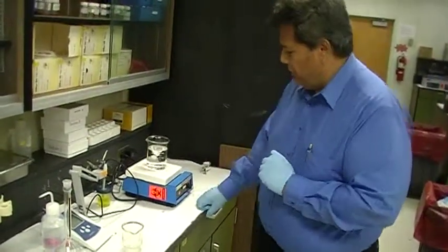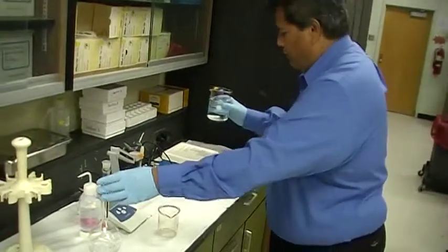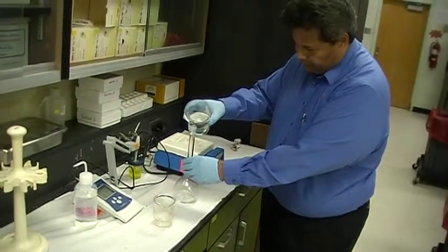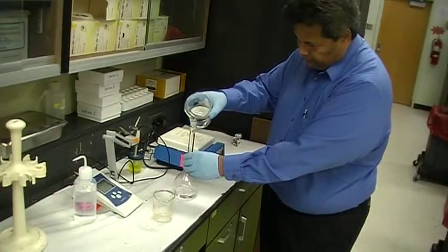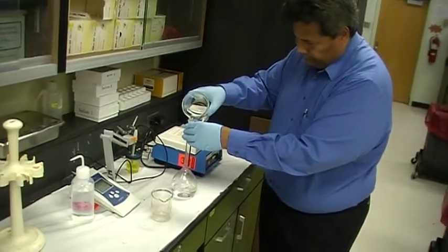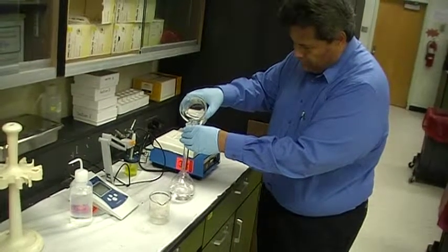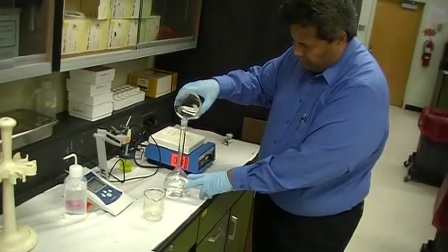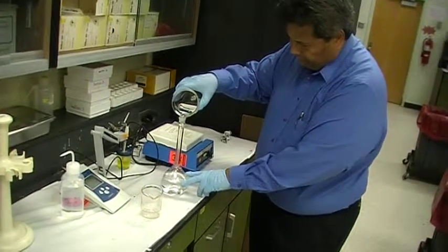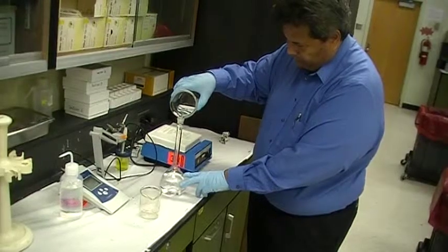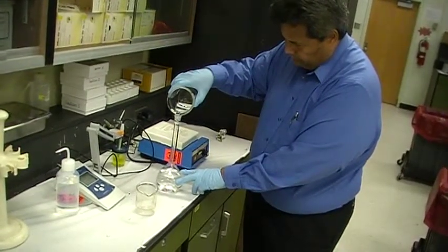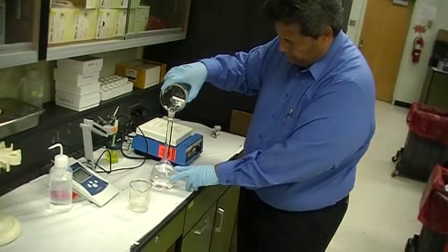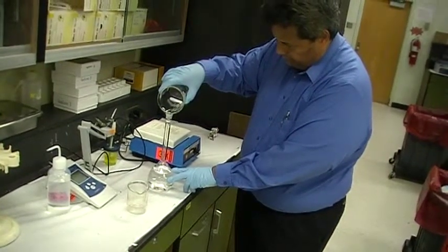The next thing you do is you turn the stirrer off, and you pour it into a 500 mil volumetric flask. And if you want, you can actually use a funnel for this one. But since we're just demonstrating it, I usually don't use a funnel. And make sure that all of the liquid has come out.